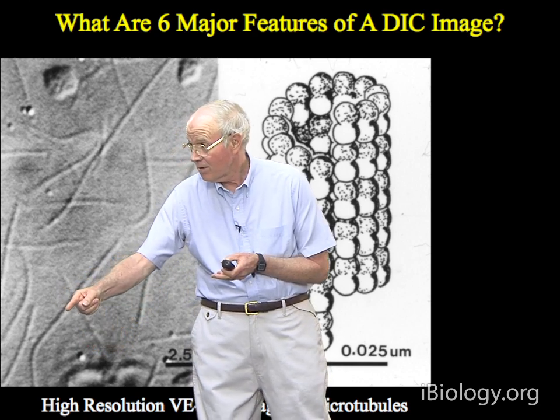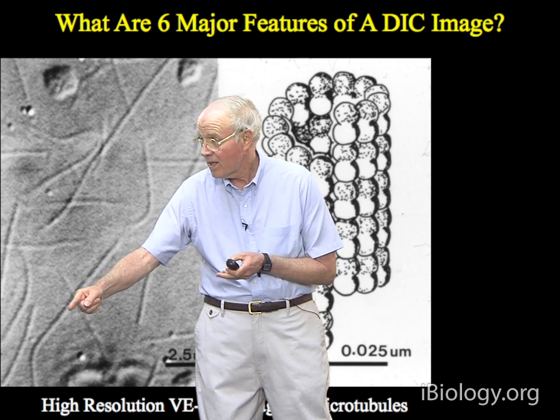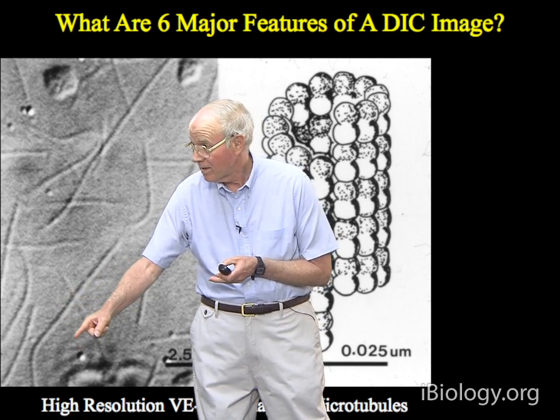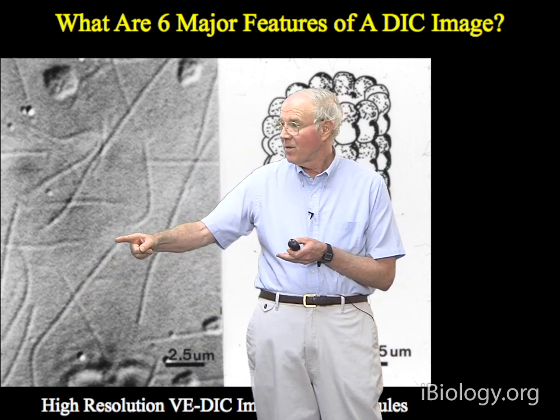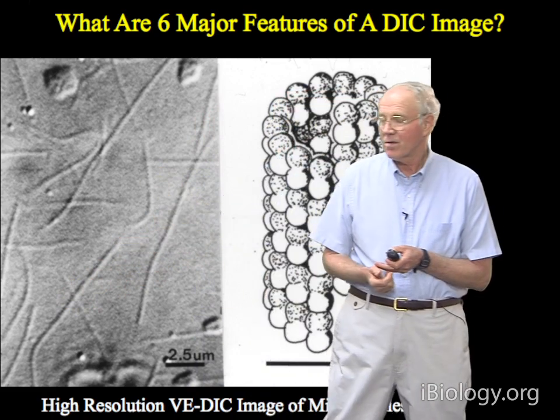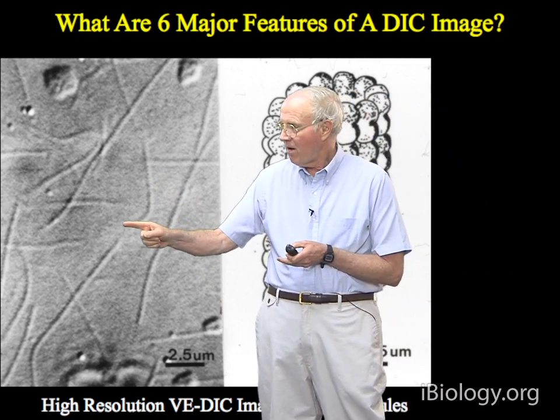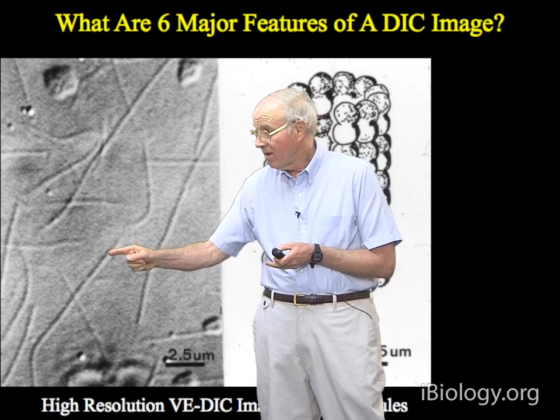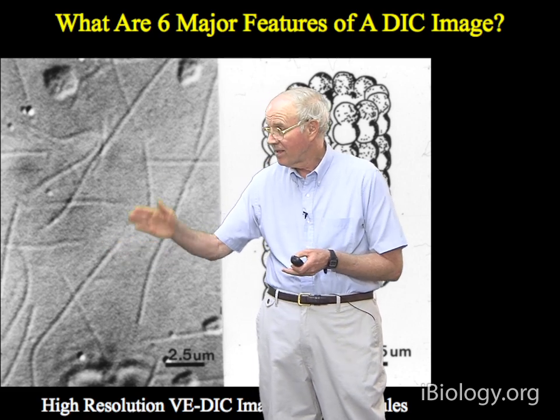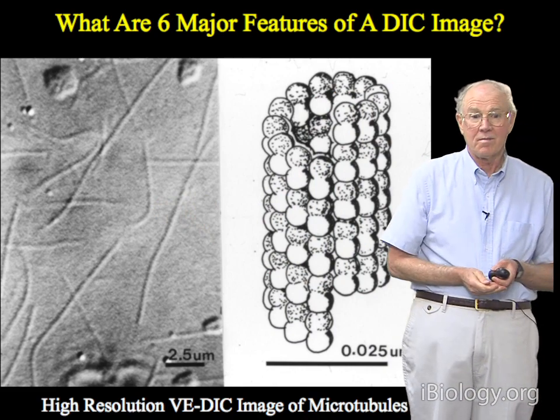And so if we look at this microtubule right here, you can see this edge here on the left is black, and this right edge is white. And all along the length of this, we have black, white, all the way up to this point here, which probably came up off the cover slip, so you don't get to see it. It's just simply that all these individual scatterers are all producing this paired white-black image. They're all stacked linearly on each other, and that then defines the axis of the microtubule.